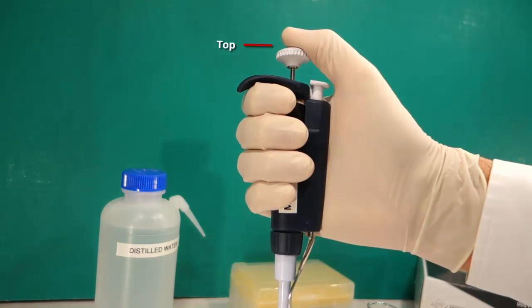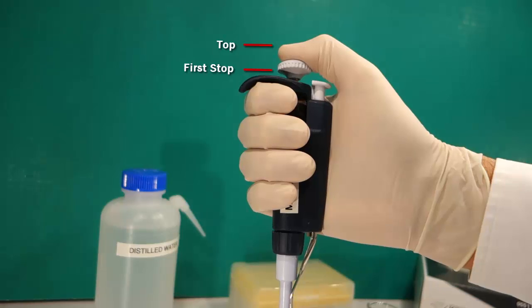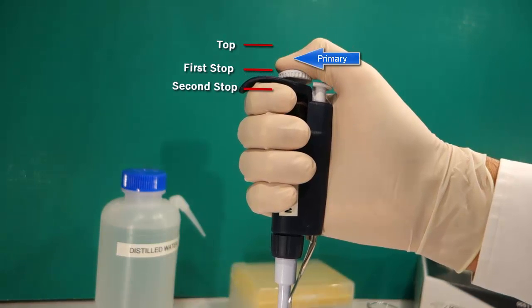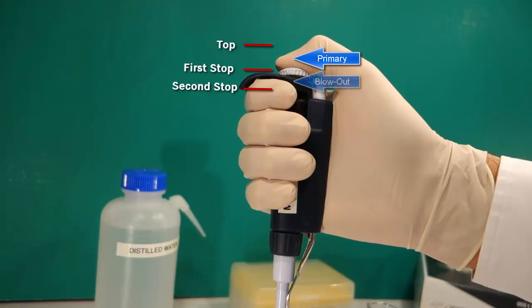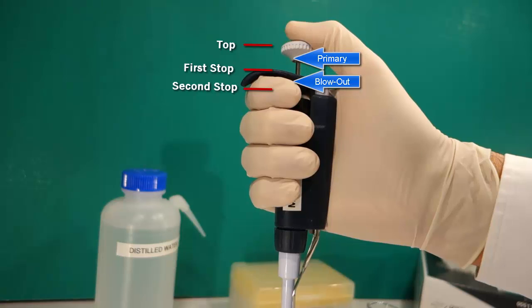Manual pipettes have three main plunger positions or stops: top, first, and second stops. The movement between the top and the first stop is called the primary stroke, and the movement between the first and the second stop is called the blowout.